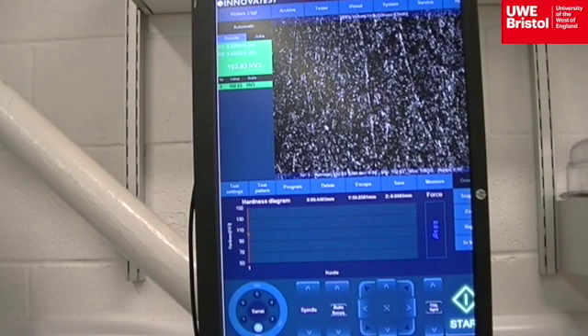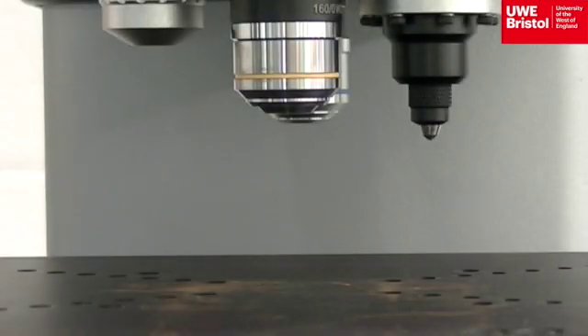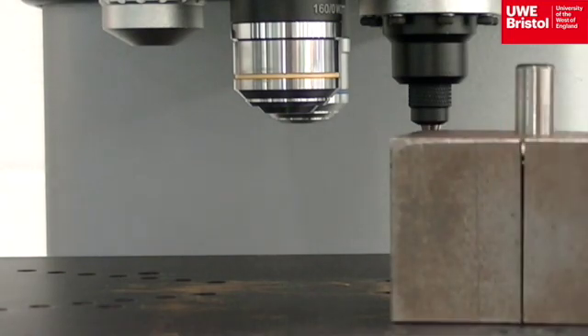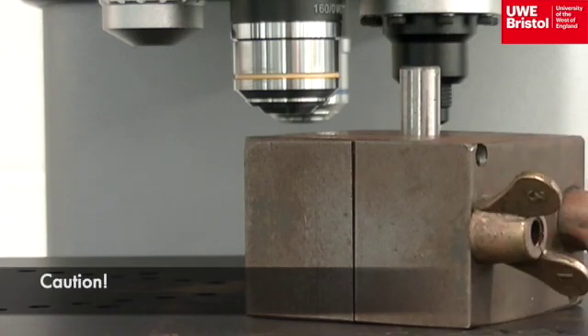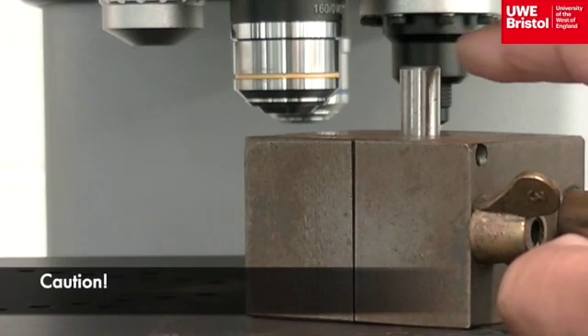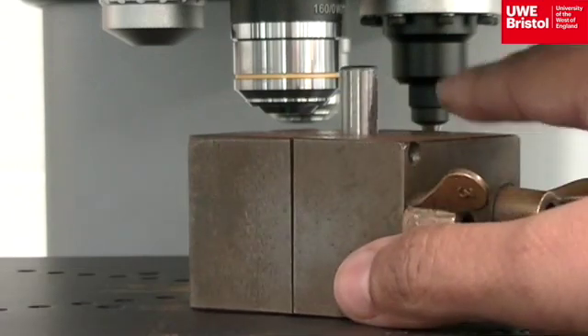Autofocus is required again as very few specimens are entirely flat across their full surface. The height of the platen will need adjustment, especially with significant height differences between specimens and their holders. If the platen is not moved lower down in advance of the test, when the indenter moves into position it would cause damage to the equipment.